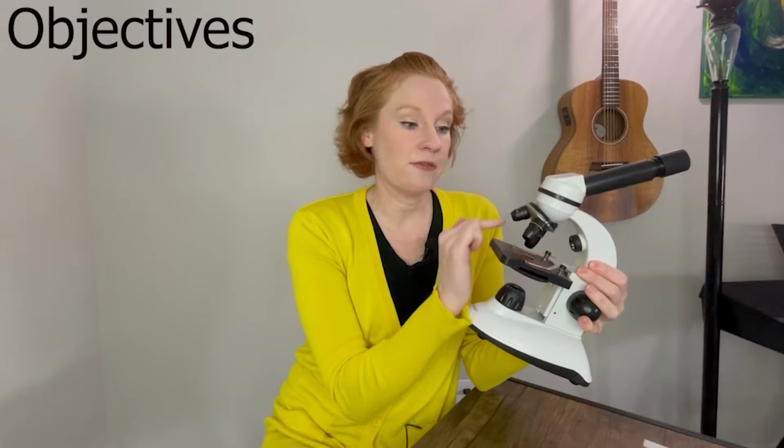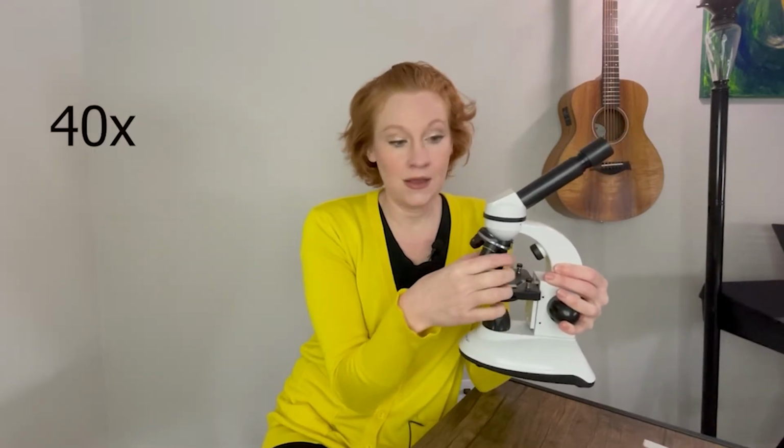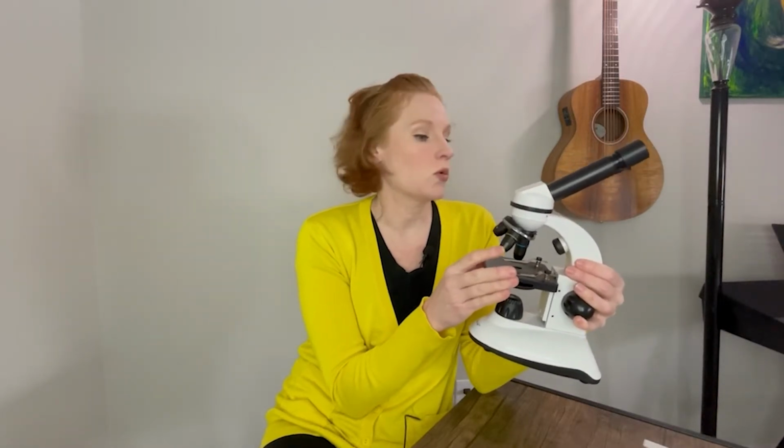This here is the base. And the most important part are these objective lenses. Now, they come in different magnifications. Most of the basic microscopes will have a 4x, which is 4 times magnification, 10x, and a 40x. On more expensive microscopes, they have a 100x objective. So if you want to see things that are 100 times their normal size, then you would want an objective lens that's 100x. This part here, this is called the stage.